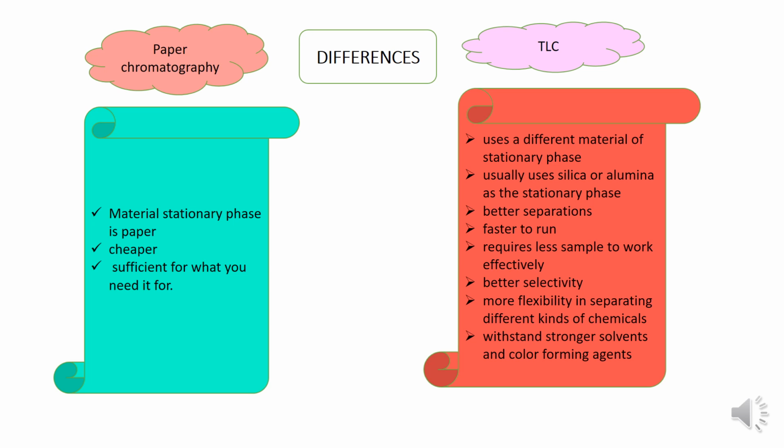It has better separation, is faster to run, requires less sample to work effectively, has better selectivity, more flexibility in separating different kinds of chemicals, and can withstand stronger solvents and color forming agents.